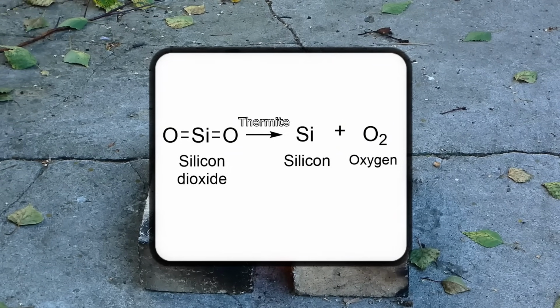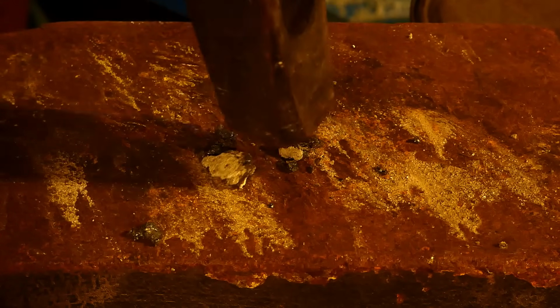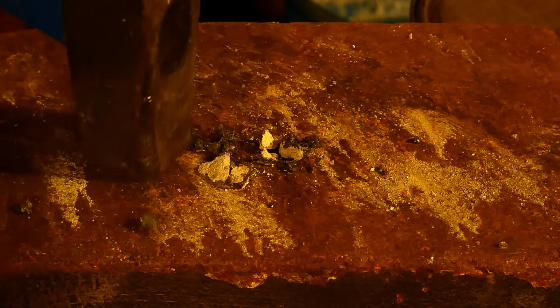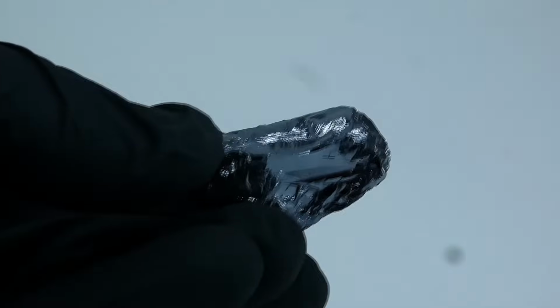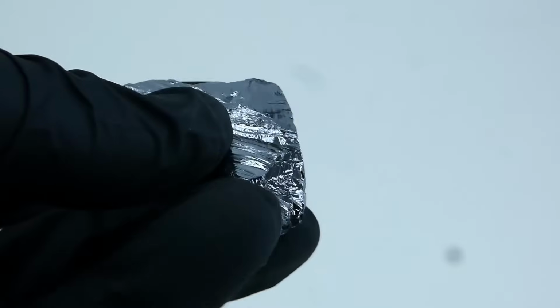However, in this specific case, there is a big catch. You see, when a thermite reaction results in the formation of a metal, it is pretty easy to separate it from other oxide products because it is much heavier, and it is exactly the case with the iron oxide aluminum thermite. However, in the case of silicon, it is not exactly a metal and is also very brittle, which means that by smacking it with a hammer, it would be impossible to separate it from the other products.